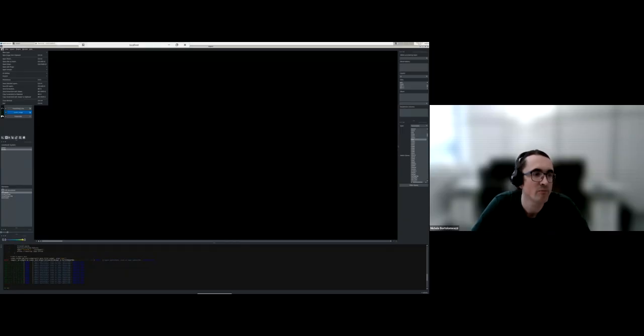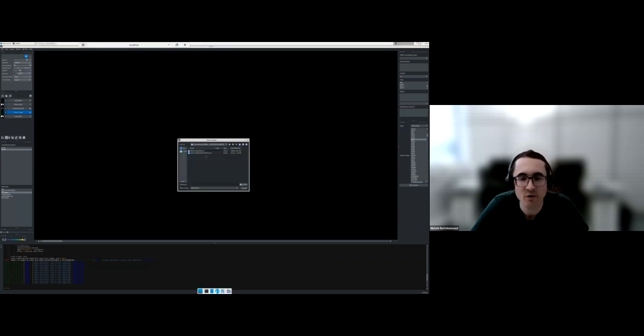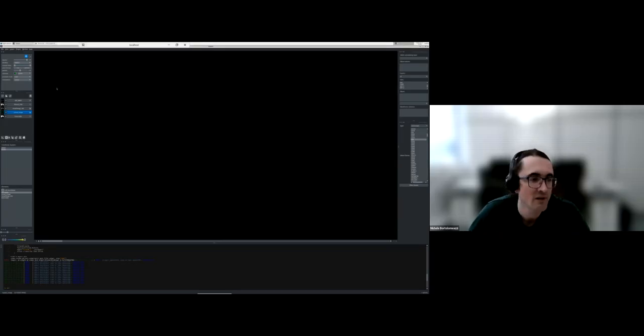The way we generally use it is to just choose to open a folder with a plugin, open folder. I select my spatial data folder, click OK, and then it will load the interface of napari. And this is the standard napari interface here.